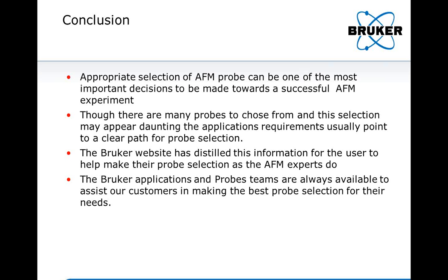So in conclusion, again, to reiterate, the appropriate selection of an AFM probe can be one of the most important decisions that you make towards a successful AFM experiment. Although there are many probes to choose from, and this selection may appear daunting, the application's requirements usually point to a clear path for probe selection.